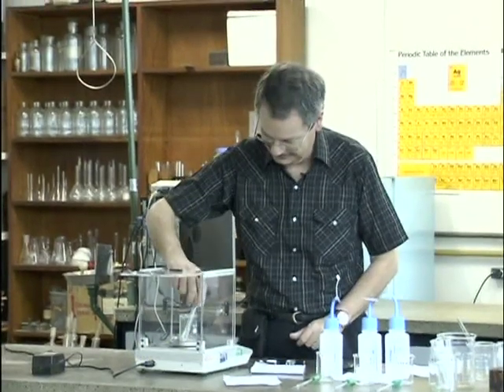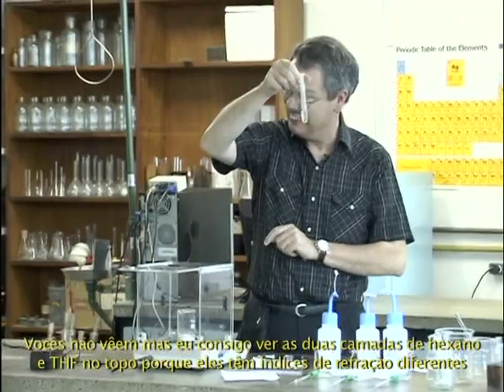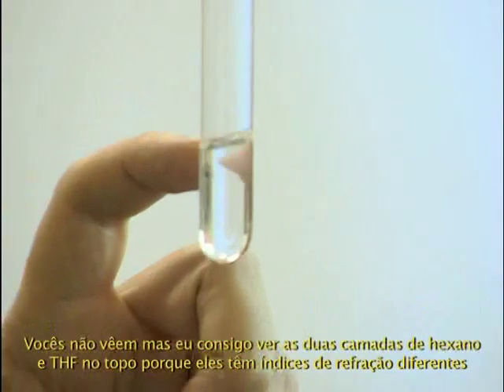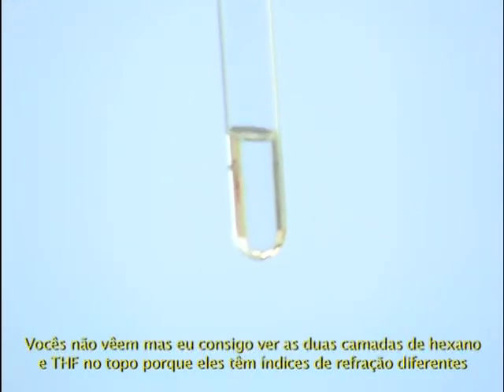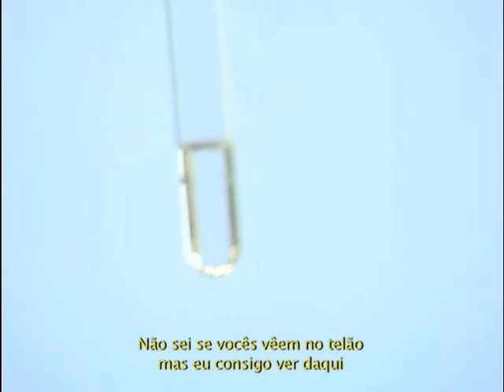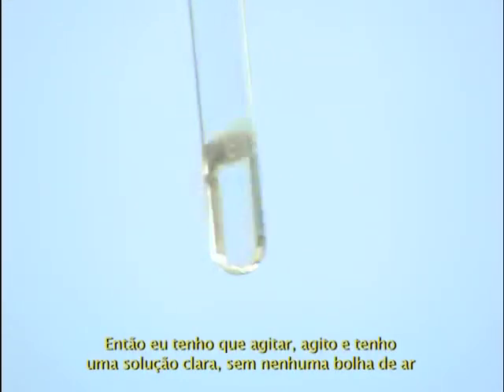You don't see it, but I can see the two layers of THF and hexane at the top because it's a different refractive index. I don't know if it shows on the movie, but I see it by eye. So I have to shake.